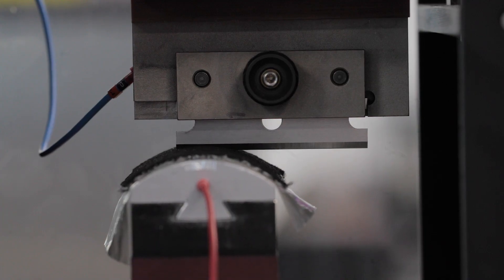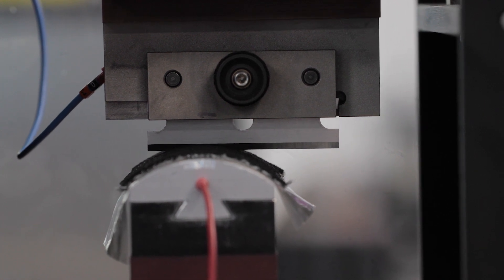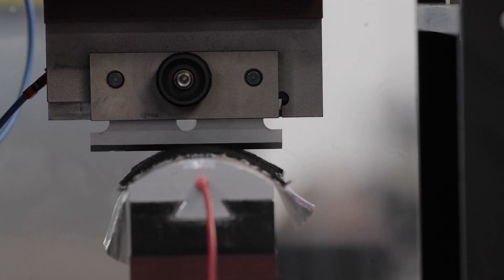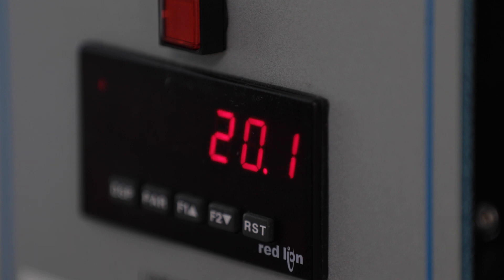Once raised into place, the cut resistance evaluator drives a straight-edged blade across the glove sample until it cuts through, and the distance moved by the blade is recorded. In this example, the glove resists being cut through by the blade until it is cut for 20.2 millimeters.